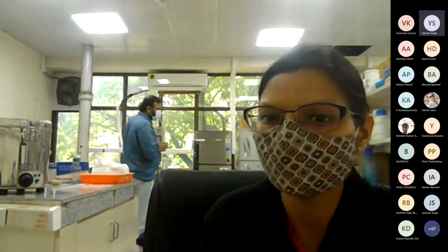There are different promoters like T7, ARA promoter, PBAD. All these promoters are under the control of some activators. They are inactive until they are made active by the addition of an inducer. So when the culture is in its early log phase, we induce one of our flasks, and after that we collect samples from time to time. Is that clear?